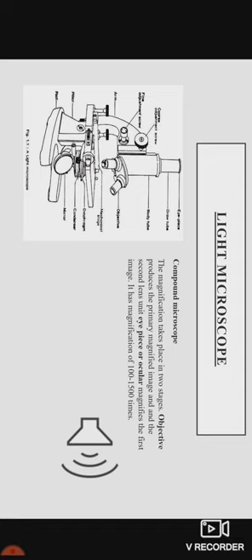Mono means one ocular, that is eyepiece, and mono-objective, one objective lens, and both are working together at the same time. So it is called monocular mono-objective microscope. The simple student's microscope, generally used in biological laboratory to observe tiny cells, is called compound microscope.